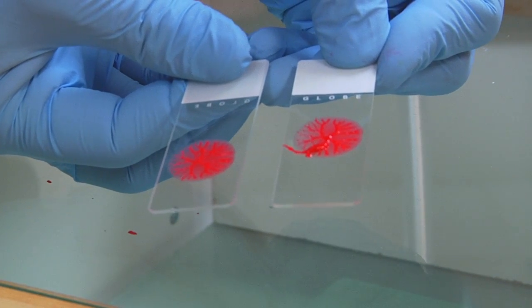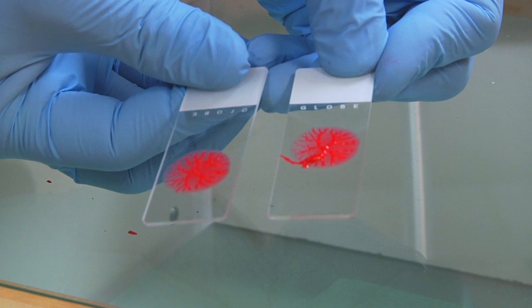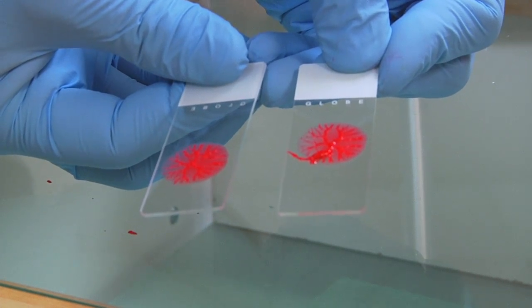So staining characteristics of the material on this technique are least desirable for the cytopathologist when they are reviewing the slide.